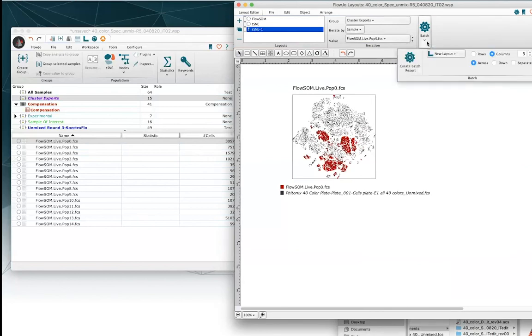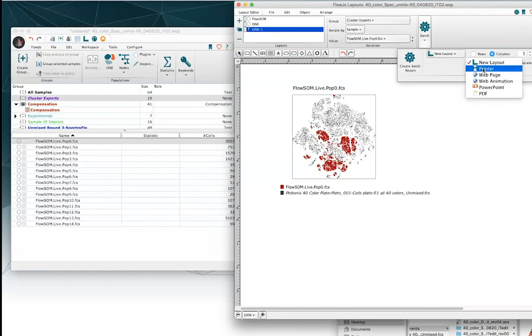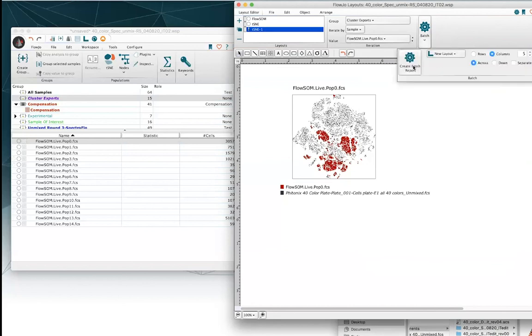Now I really am ready to batch. In the batch section, you can click create batch report, and it's going to batch to whatever location you've set here. By default it's going to be our new layout, but you can also batch to printer, to a web page, or directly to PowerPoint if you prefer. I always recommend batching locally first as a new layout, then you can always export that new layout or afterwards batch to the file of interest.